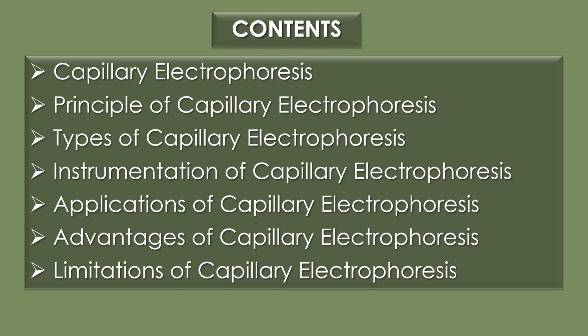This video contains the following contents: introduction about capillary electrophoresis, followed by principle of capillary electrophoresis, types of capillary electrophoresis, instrumentation of capillary electrophoresis, applications of capillary electrophoresis, advantages of capillary electrophoresis, and finally limitations of capillary electrophoresis.